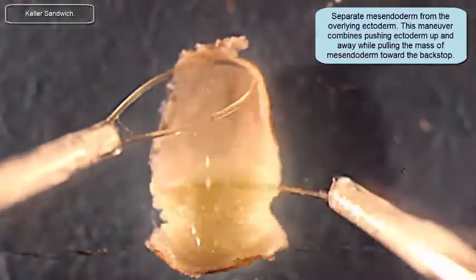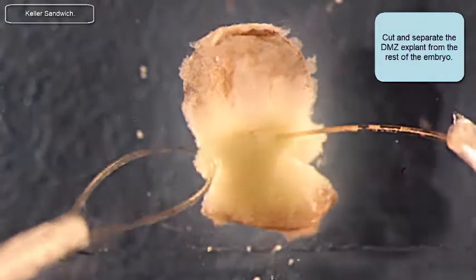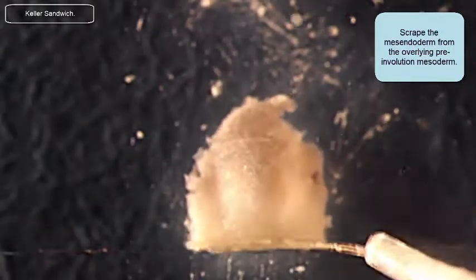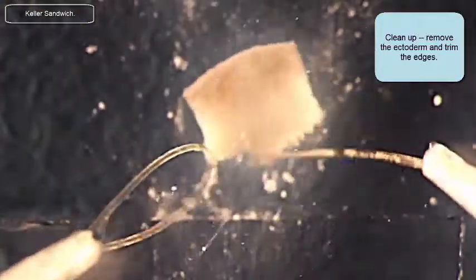I'm going to pull the mesendoderm away from the overlying ectoderm. Here I'm going to cut that explant away from the rest of the embryo, taking away all the vegetal endoderm. I'm going to scrape off the last bits of the vegetal endoderm at the vegetal end of this explant, using the backstop as a guide for thickness. I'm going to cut away the animal cap ectoderm from this explant and now trimming it down to the size that I want.